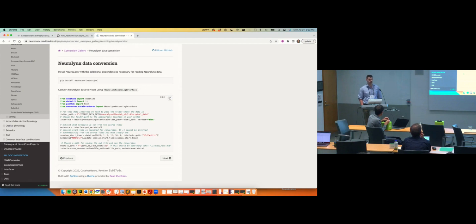And then you might just store timestamps, even if it's a week long. It's really a judgment call, right? If you're truly not recording for 5 minutes, maybe it would be better to have 2 electrical series. I don't know. At a certain point, it's going to come down to the details of your experiment and of the analyses you want to do. But those are your options: to use timestamps to express the irregularity or to create multiple electrical series.